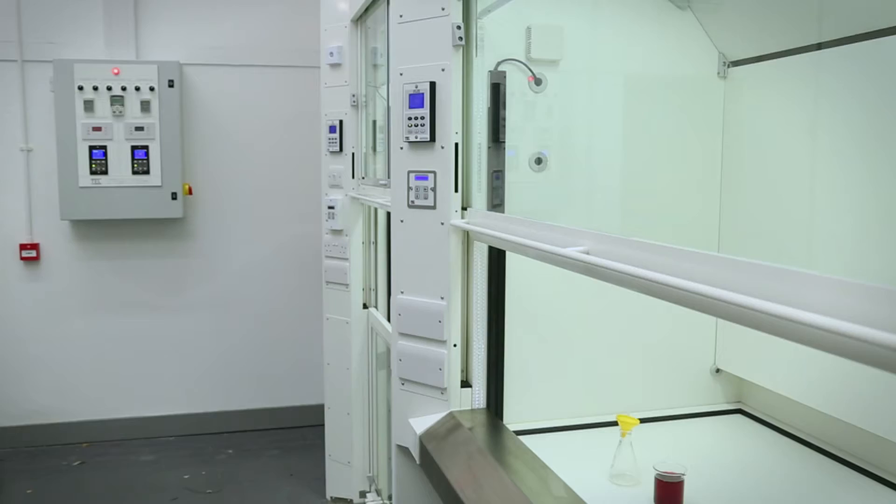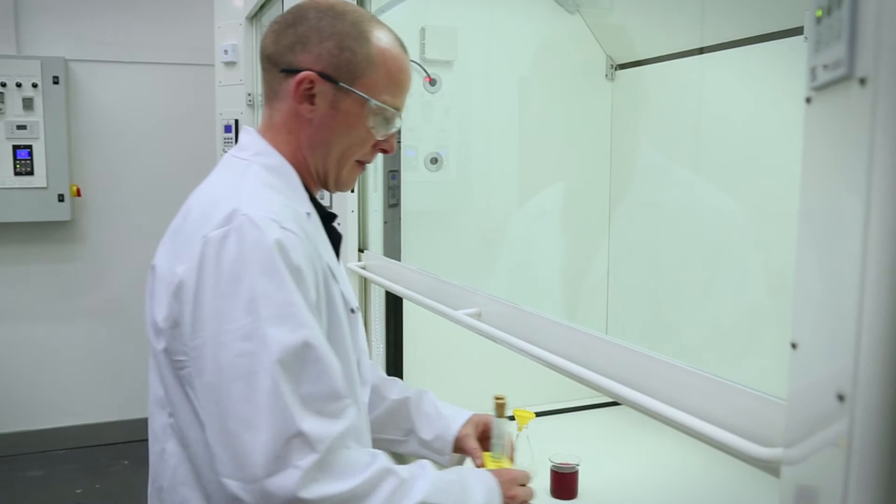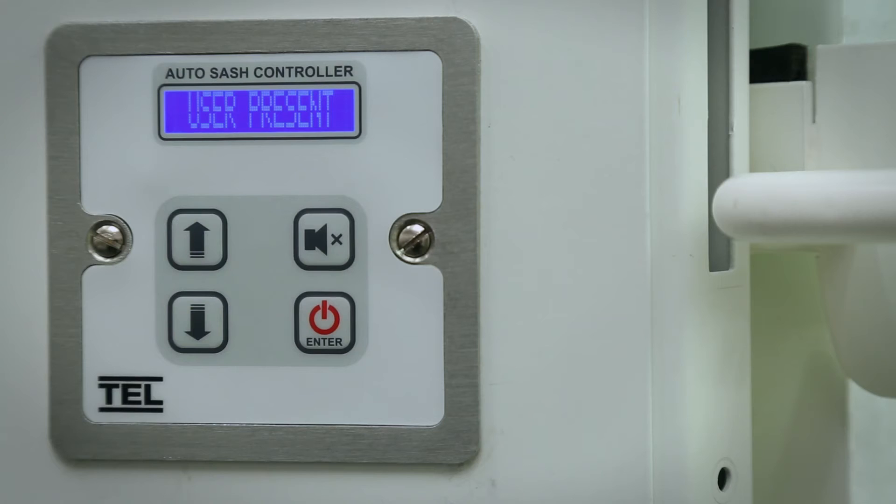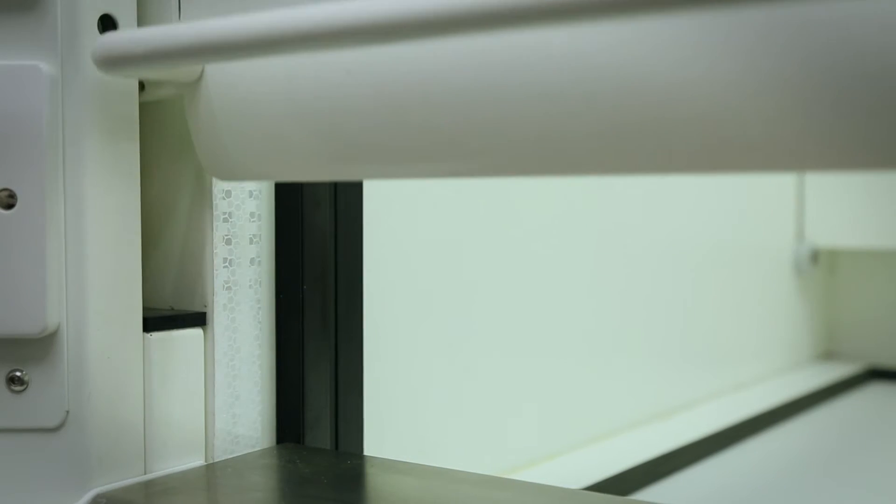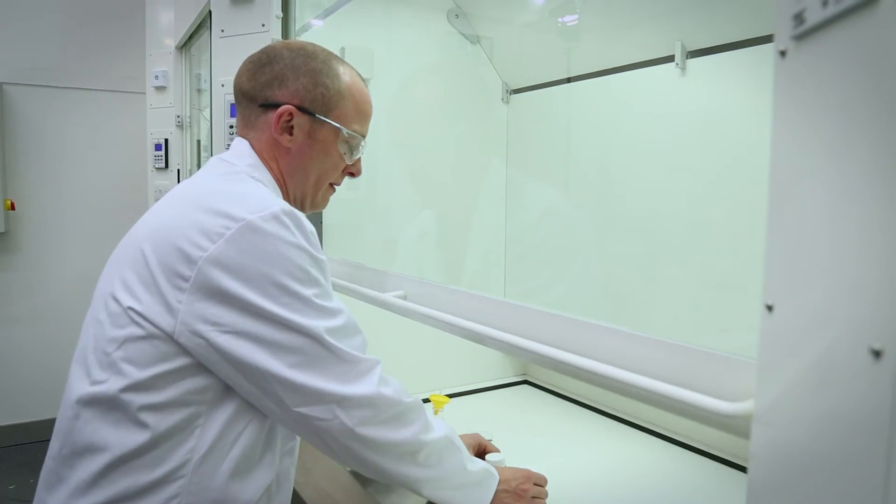The auto sash will automatically stop closing if a user is detected during the closing cycle. The sequence is reset once the user walks away. The auto open function will automatically open the sash when the user returns to the fume cupboard.